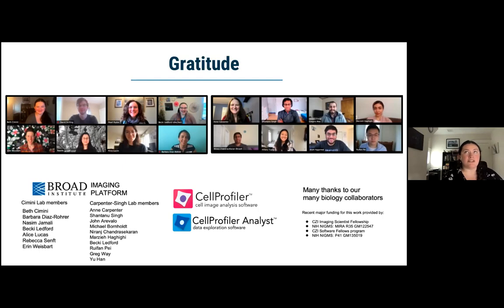In terms of understanding the interactions between the features, there's definitely a lot you can do in terms of comparing how individual features look against one another. In fact, we don't typically keep all 6,000 features. We try to remove ones that are heavily correlated with one another and get it down to what we think is the most unique, 500 to 1,000.